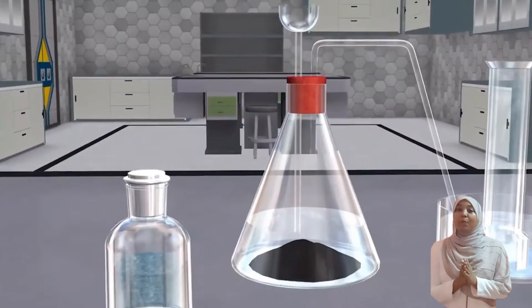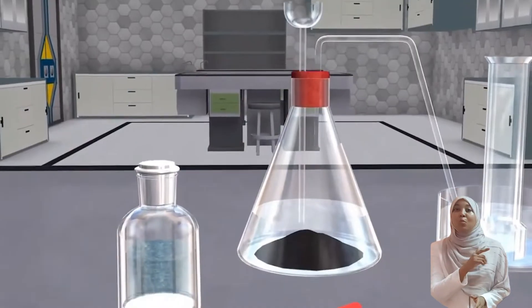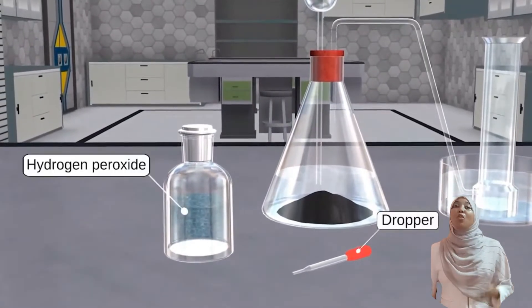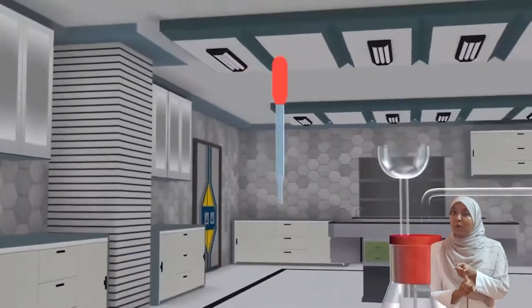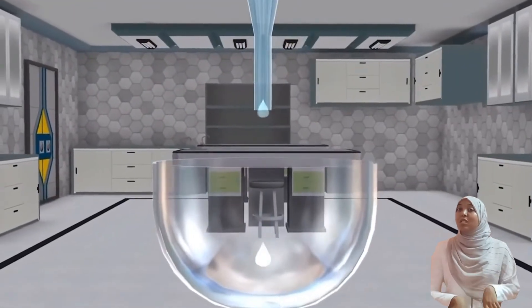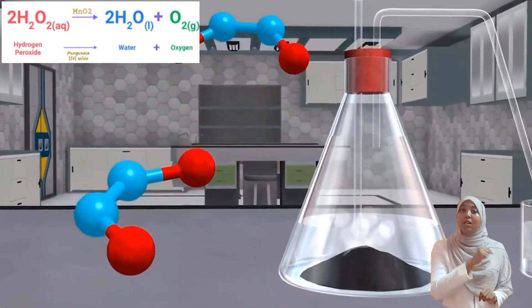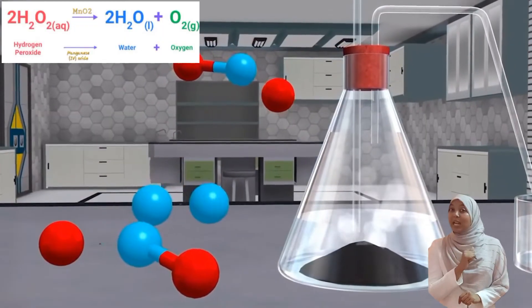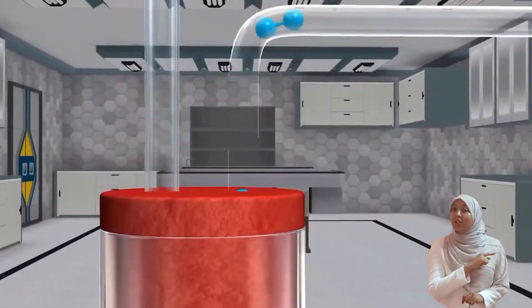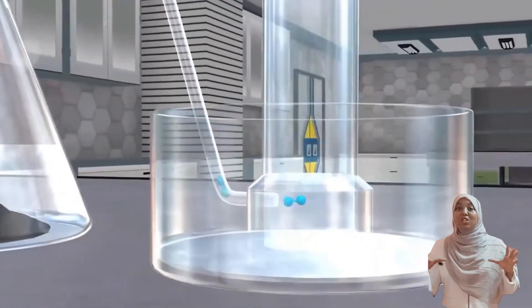We measure out a specific volume of hydrogen peroxide. Hydrogen peroxide in the presence of manganese 4 oxide (MnO2) decomposes, forming water and oxygen gas. The oxygen gas produced passes into the delivery tube and into the trough where you have the gas jar.